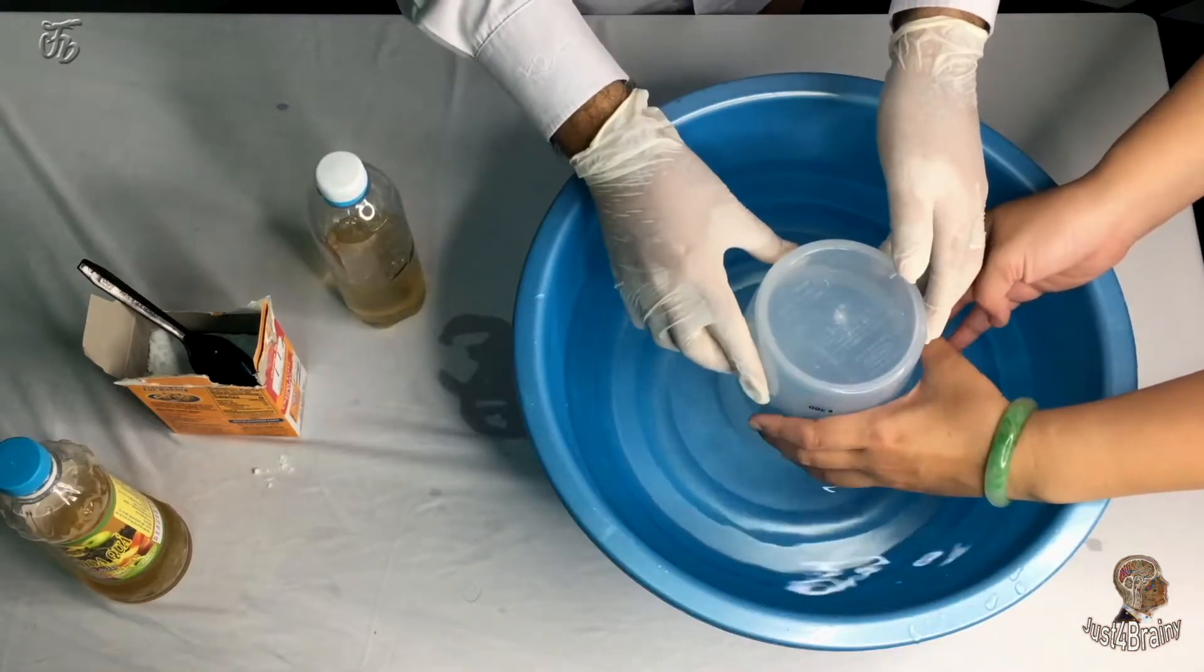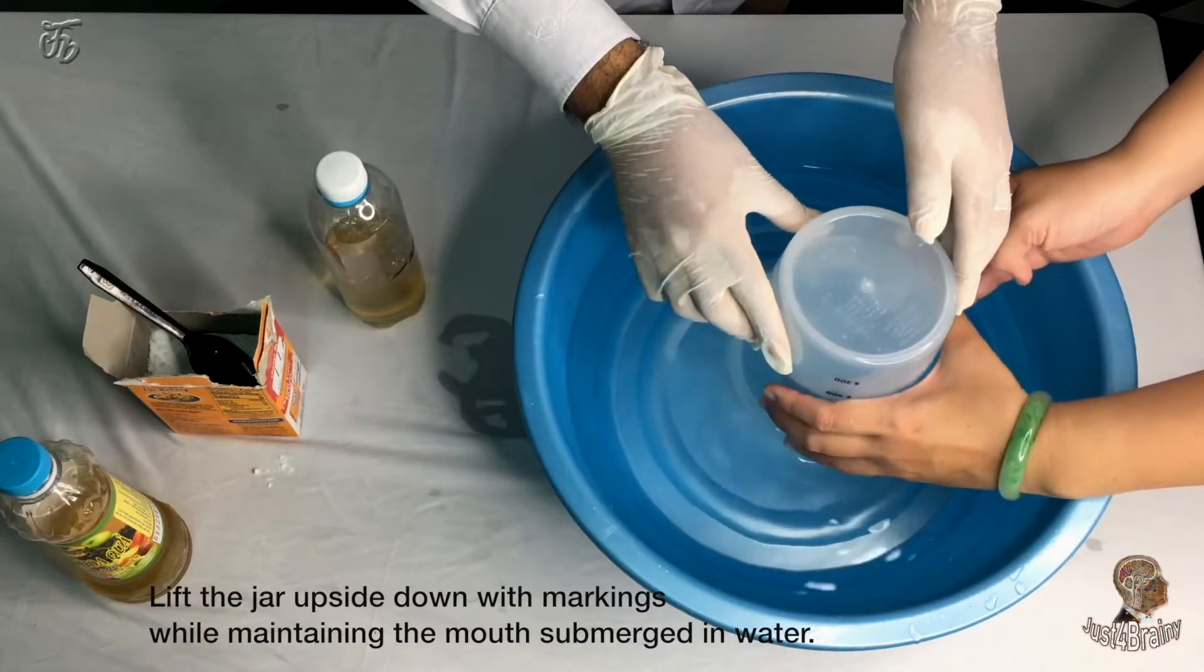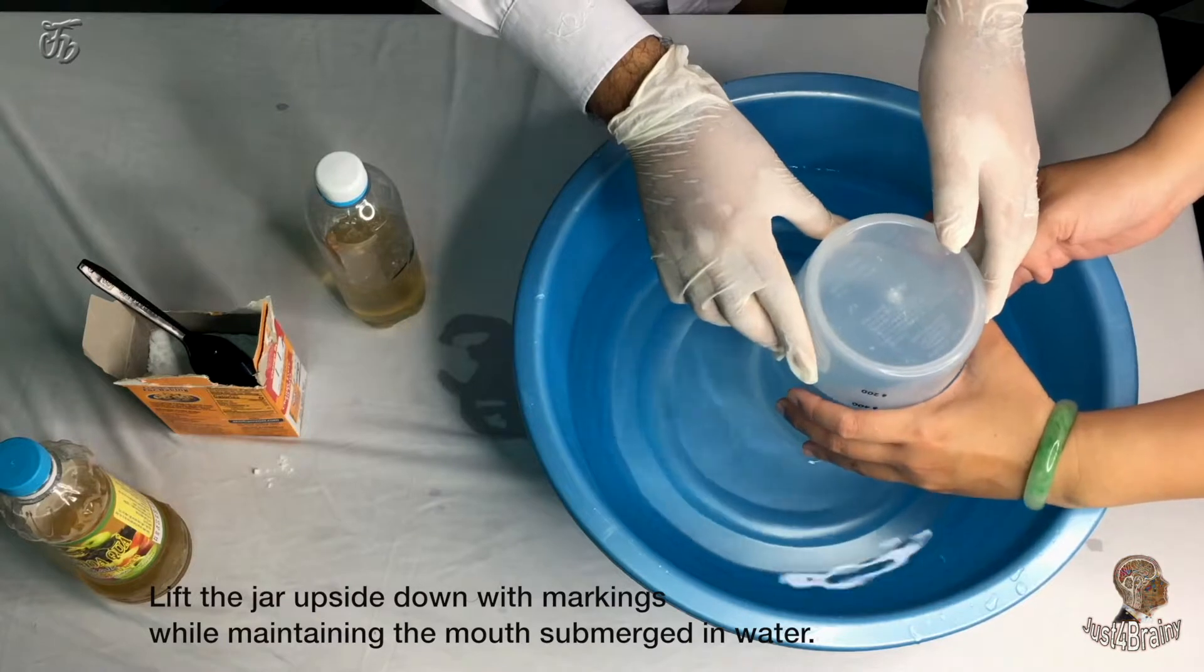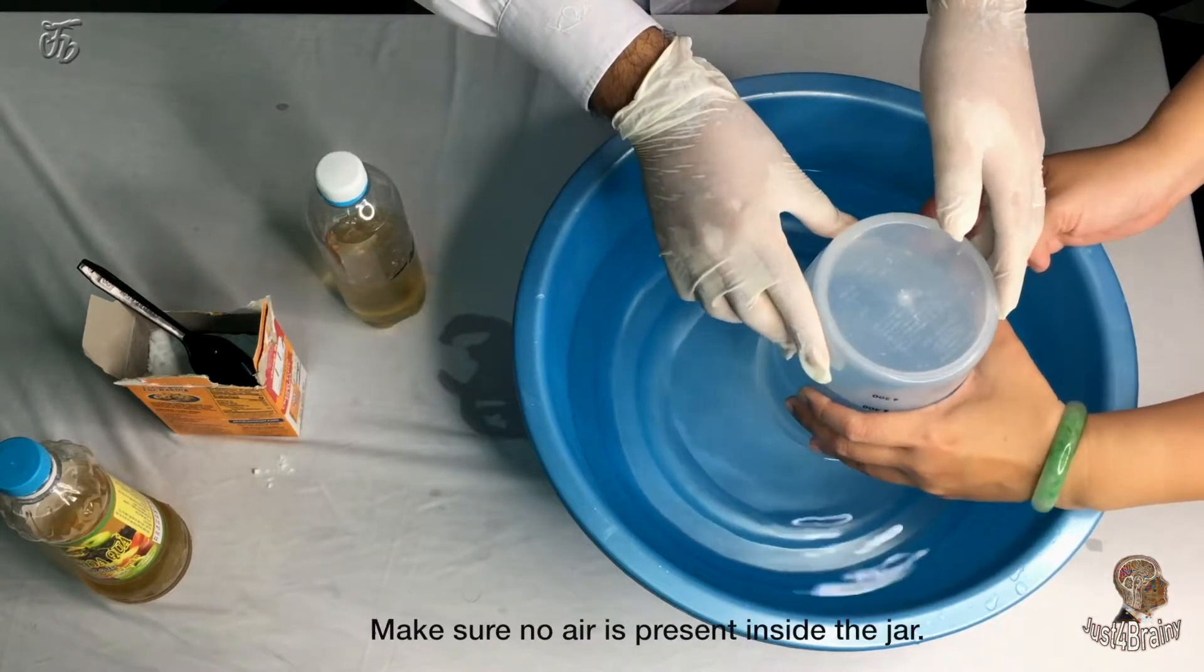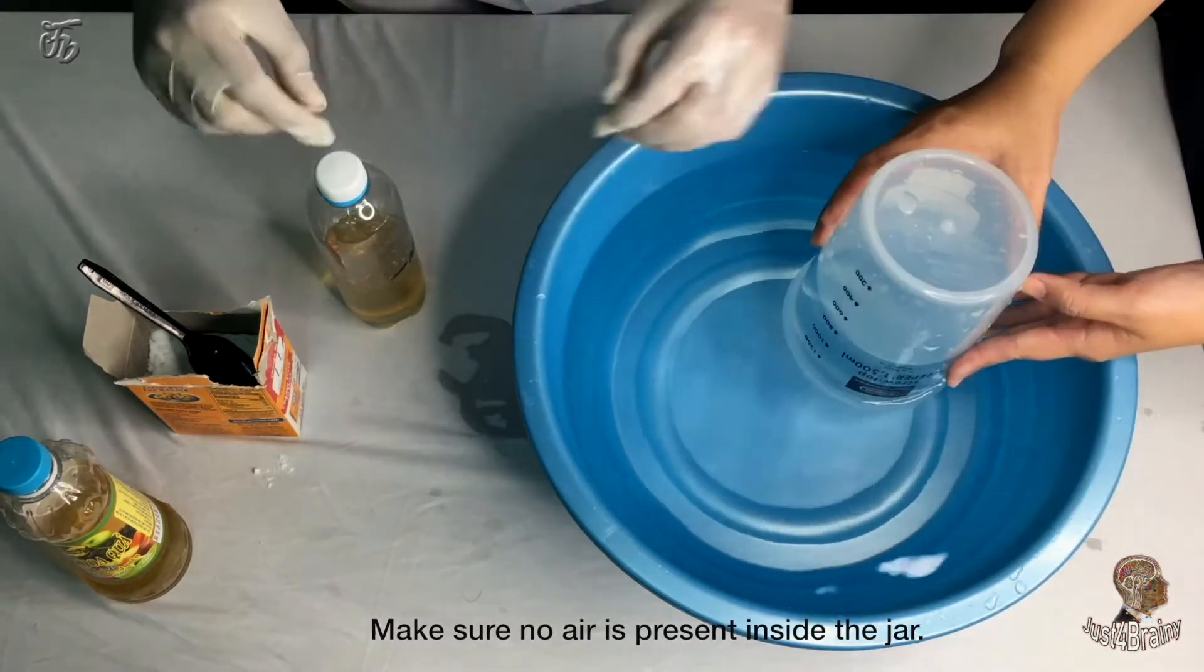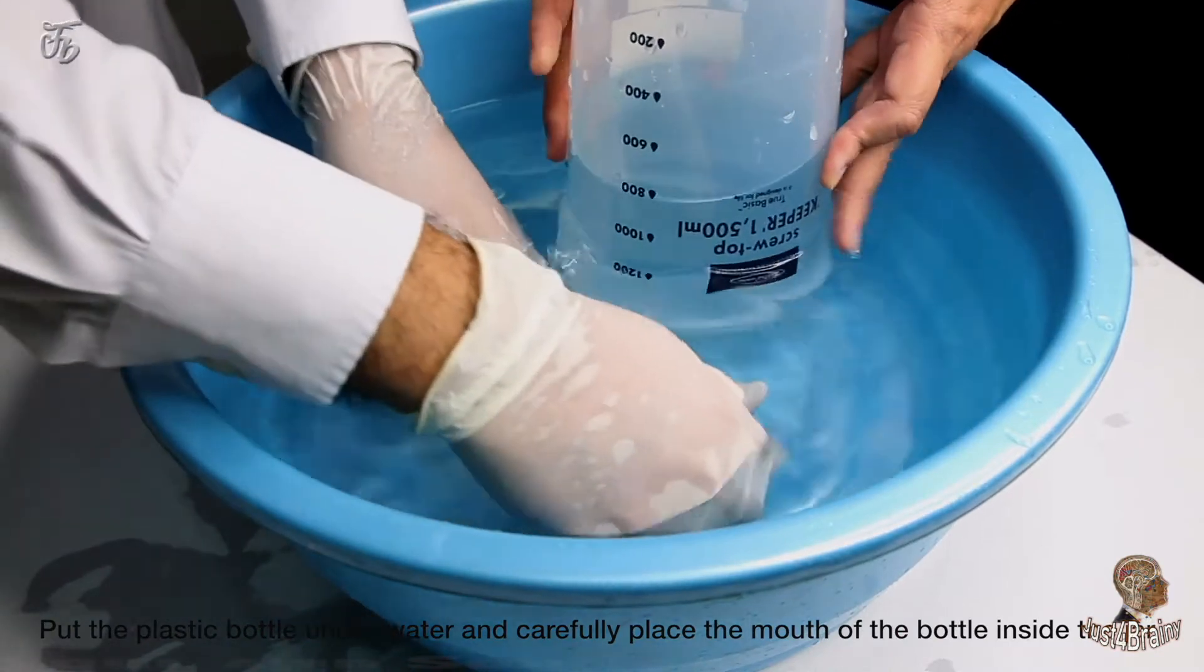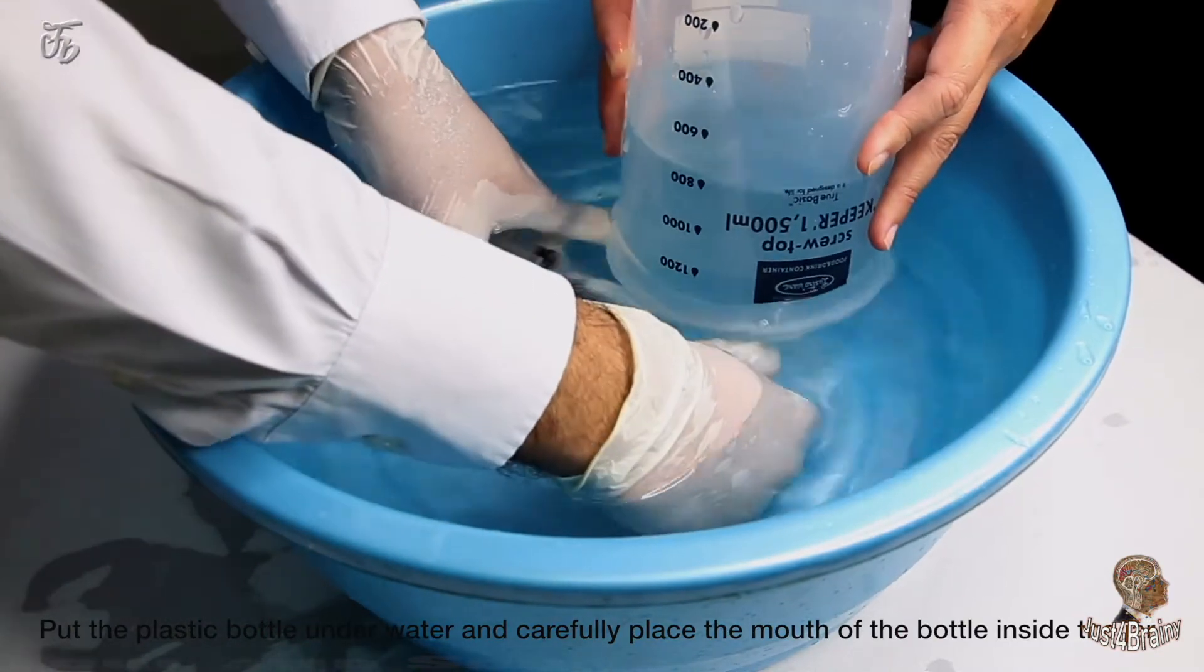You may need someone to help you with this part. Flip your jar upside down with markings while maintaining the mouth submerged in water. Make sure no air is present inside the jar. Put the plastic bottle under water and carefully place the mouth of the bottle inside the jar.